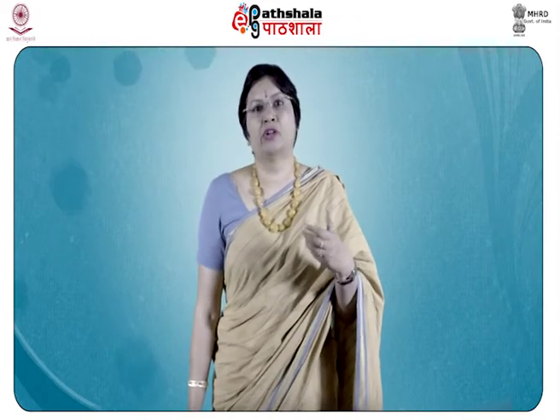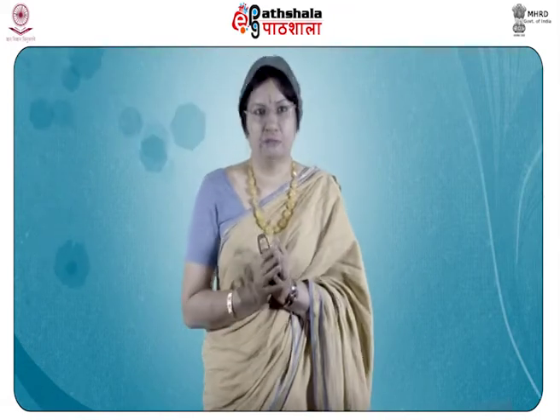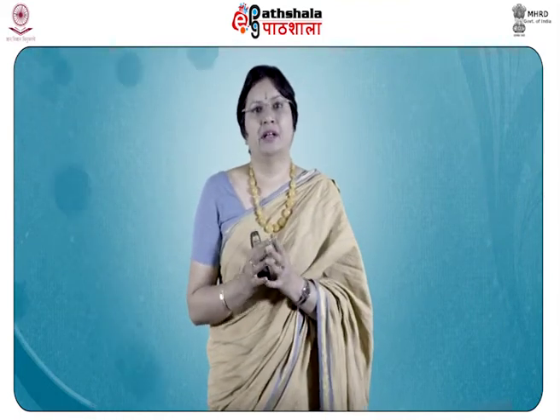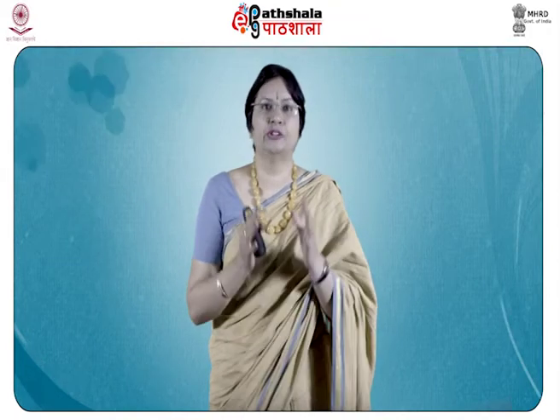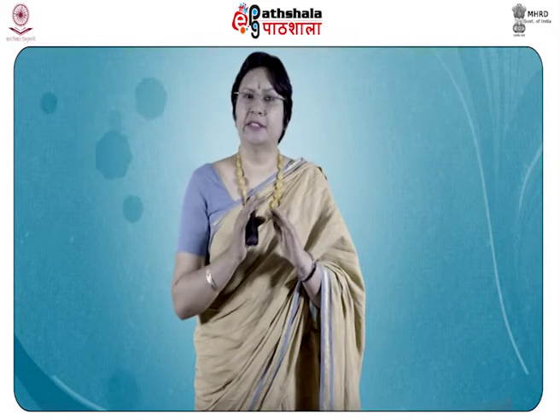And let us see what are the various tests that you have to perform in the forensic lab. So, dear students, with this background, let us try to understand how the various tests you can perform in a forensic lab. And it is a very simple chemistry.